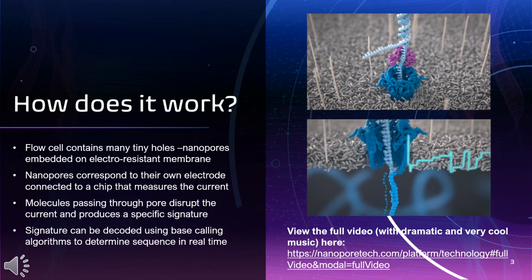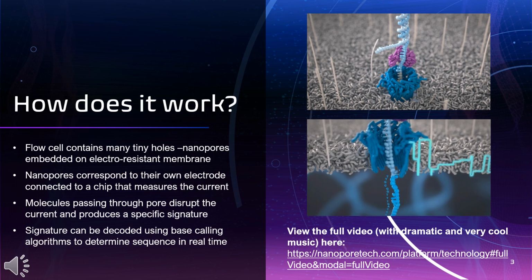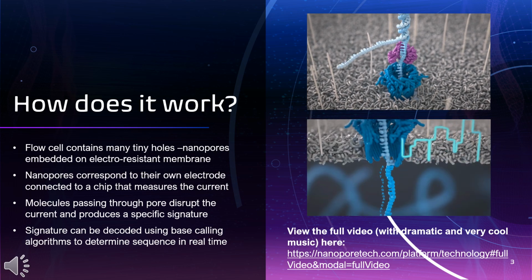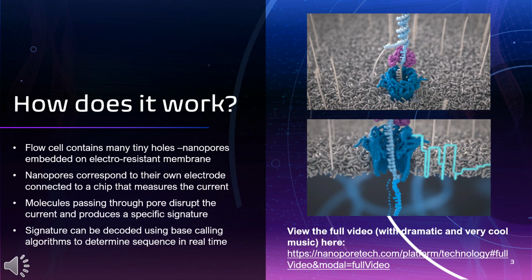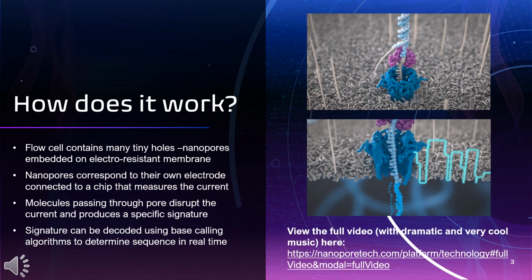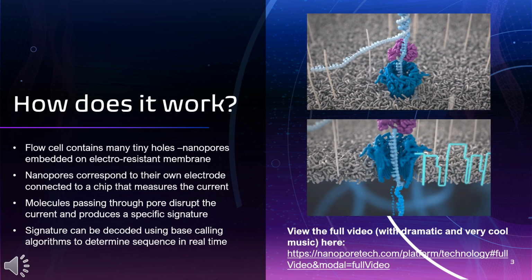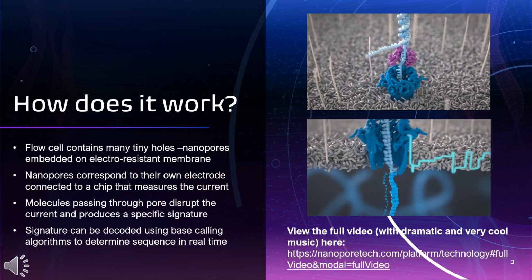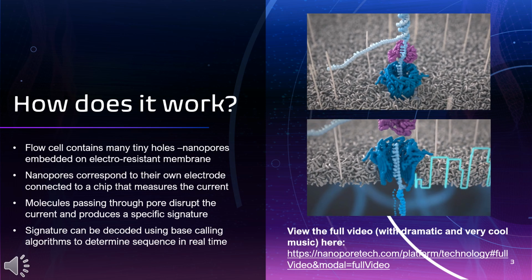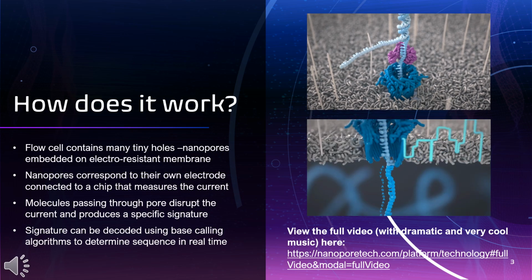Again, pretty cool. The GIFs to the right show a sample entering the nanopore. The nanopore is in the dark blue, and the sample is in the light blue, and then you have the adapter ligations in purple that help the sample bind to the nanopore. And then as it's moving through the pore, you can see that the electrical current is being generated. You can see the different signatures, which means that the different nucleotides are being found.